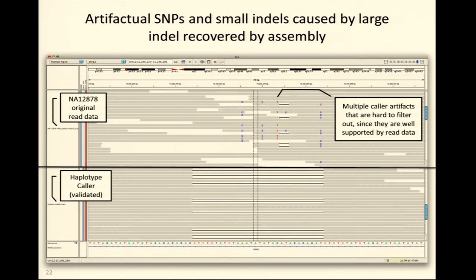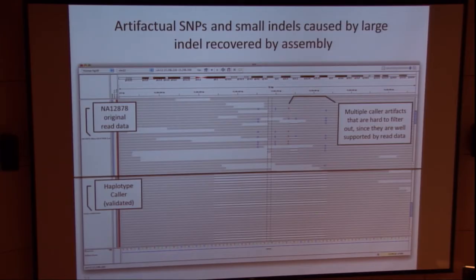You would see, well, this is actually a good SNP because there's a lot of Cs, very clean Cs. So I might say, okay, this is a heterozygous SNP. The insertion, there's some insertion here. I may want to call that again, and then there's another T insertion, and then some deletion. But then this is actually not the most parsimonious representation of the data. What's happening here is that there's a large deletion underneath.